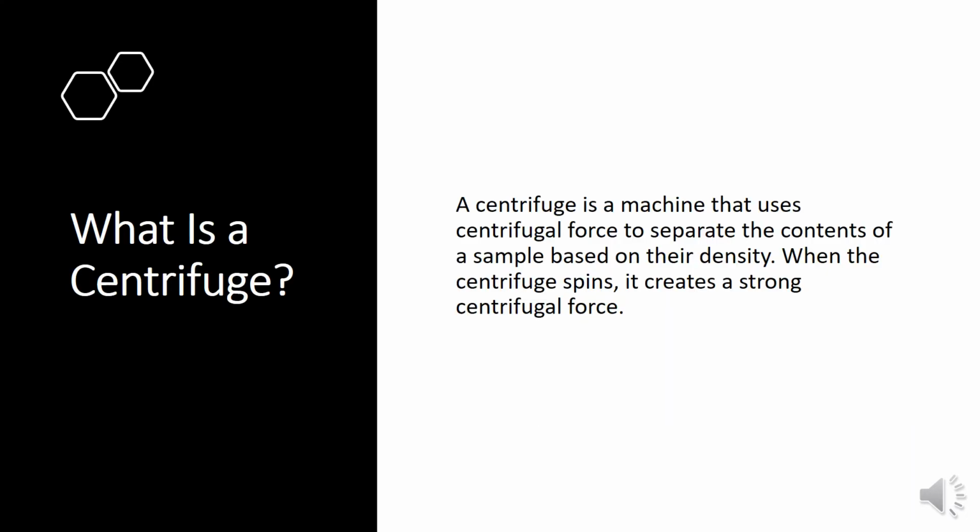Centrifuge. A centrifuge is a machine that uses centrifugal force to separate the constituents of a sample based on their density. When the centrifuge spins, it creates a strong centrifugal force, though separation will eventually happen naturally with Earth's gravity. The centrifuge machine delivers rapid results for laboratory and other applications.